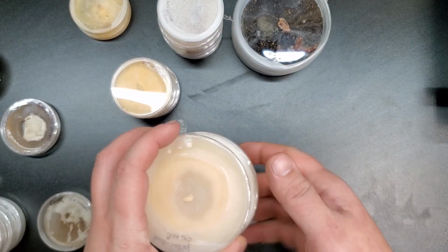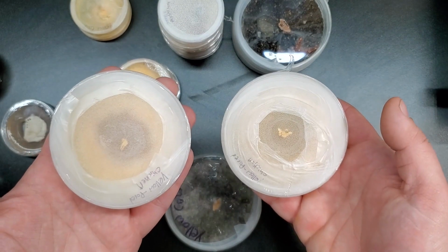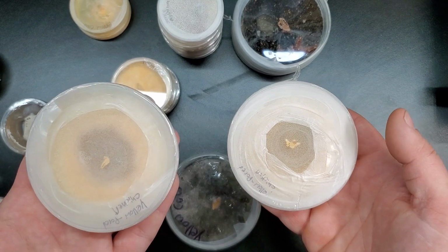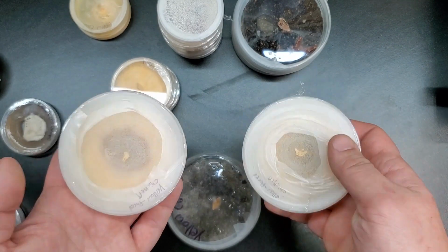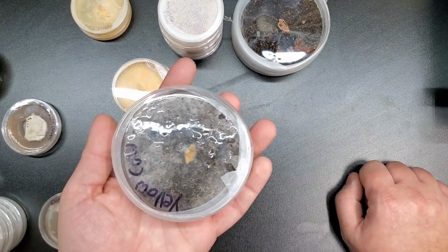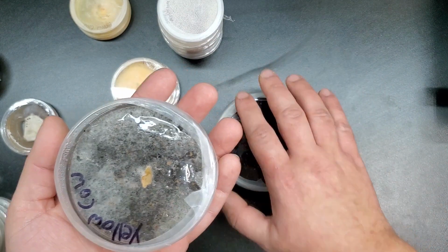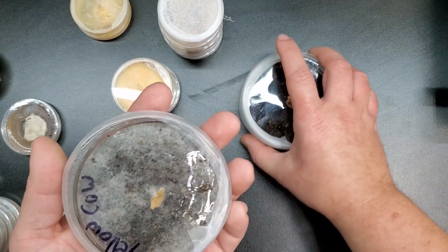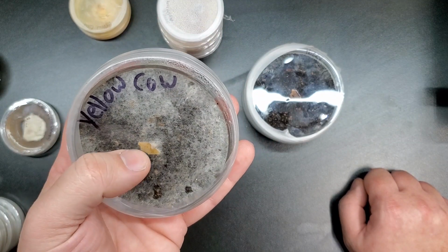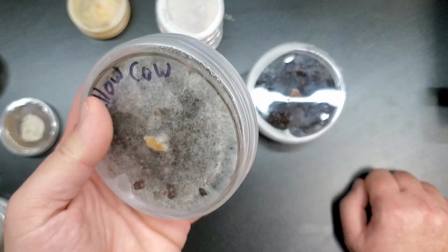And these two larger petri dishes right here are also the same yellow pored chicken of the woods mushrooms that are completely fully colonized on these 90mm petri dishes. These are perfect for my culture collection. So that's where they're going to go. And finally, right here in this last glass petri dish is some of the same substrate that I had in here and in that little Erlenmeyer flask, the coffee and the wood chips. And I have a sample of the yellow pored chicken of the woods mushroom inoculated on here, and it is currently colonizing this as well.